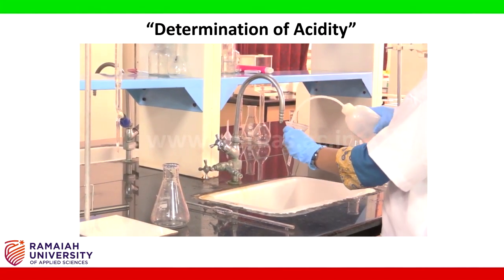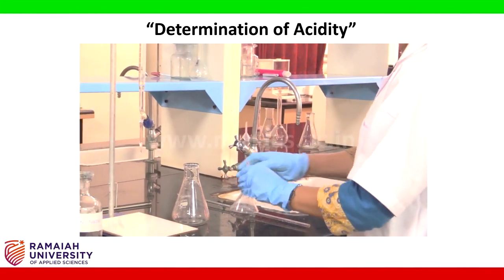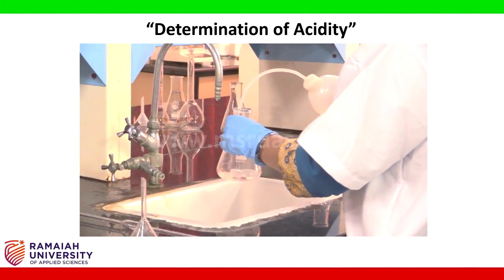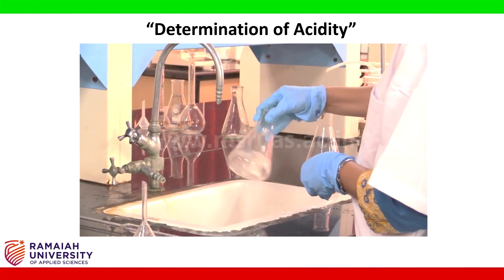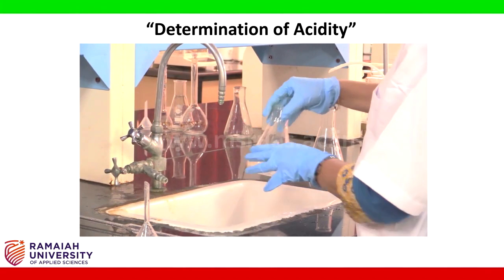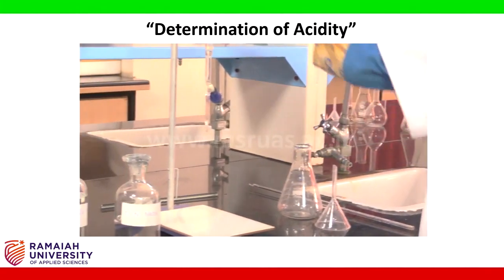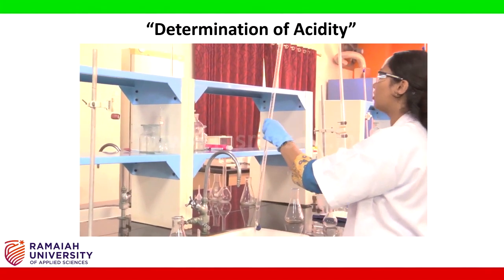Rinse the funnel with the distilled water. Also rinse the conical flask with the distilled water. Next we need to rinse the burette with the distilled water.